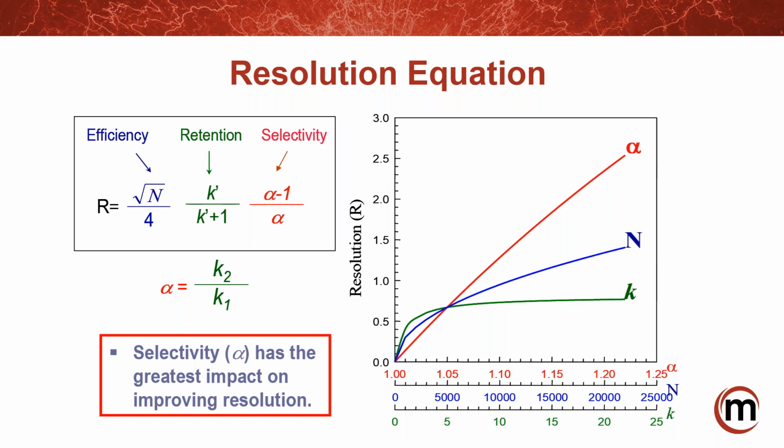I'm going to have similar benefits to what the core shell material is, but I'm going to have more retention and I'm going to have more loading capacity. Okay, well, that's cool. So what do I do with that?